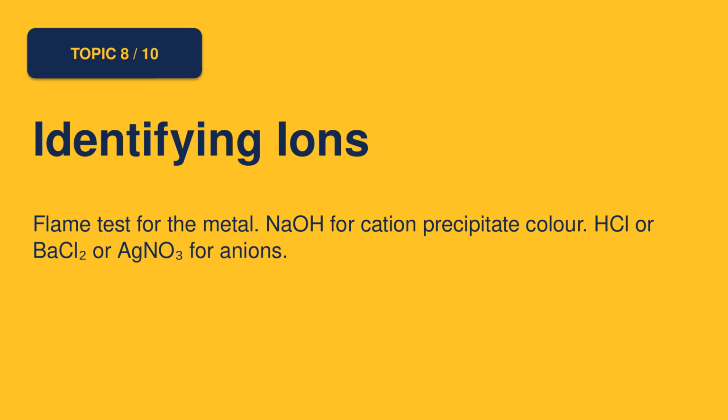Flame test for the metal. Sodium hydroxide for cation precipitate color. HCl or barium chloride or silver nitrate for anions.